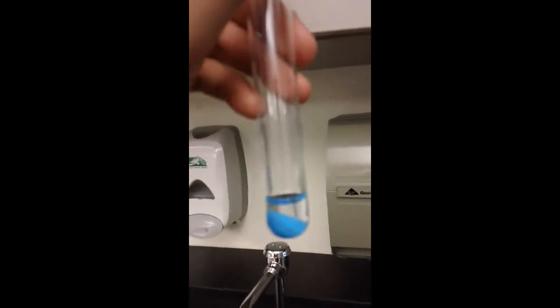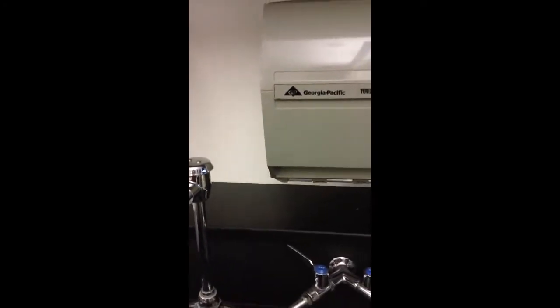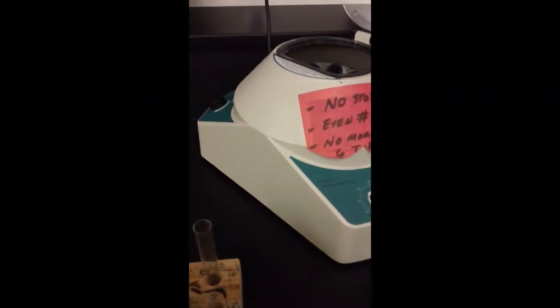This is my CU, so I need to remove the solid from the liquid, and I'll do that now. I'm going to come back to the video camera and stop the video, and I'm going to have this CU removed, and then the K doesn't have anything, so give me a moment. Alright, so now I'm back and I have the CU, the solid, different from the liquid. The liquid is now down the drain, and the solid is going to be put in here. So in this step, the FE, the ZN, and the CU all had solids, so I separated the liquid from those solids.